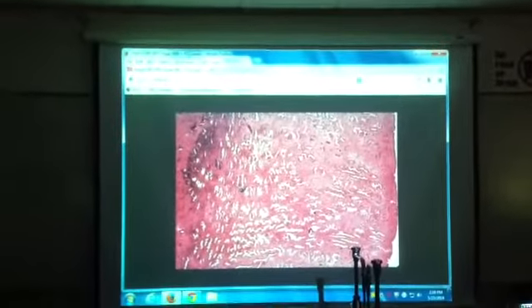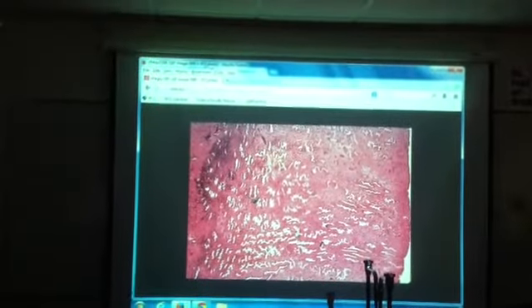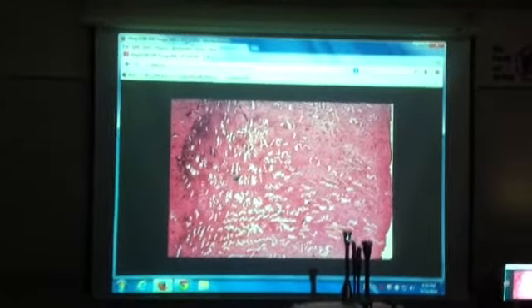Okay, smarties. Teach you with the hard one now. Name it and claim it. Secretory. How'd you know? Lots of glands, squiggly. Notice they look jagged. Corkscrew. Very good.